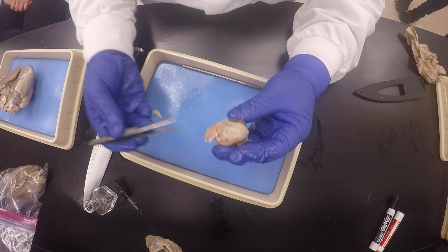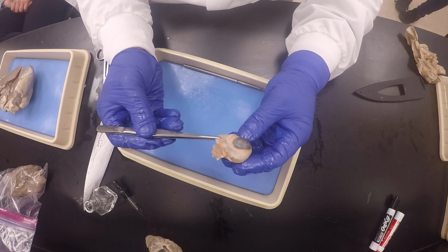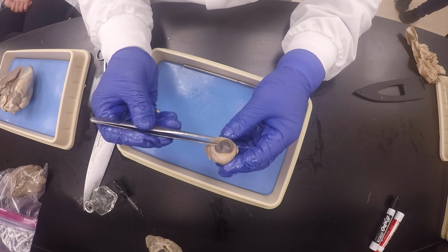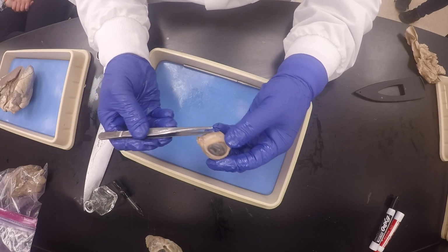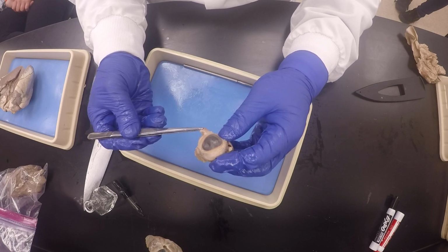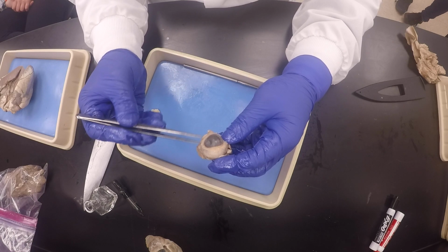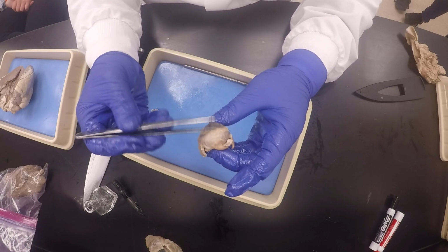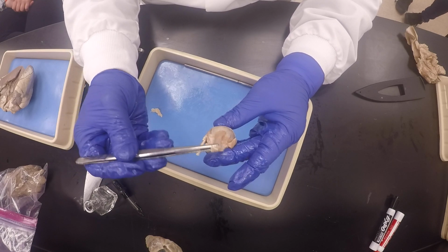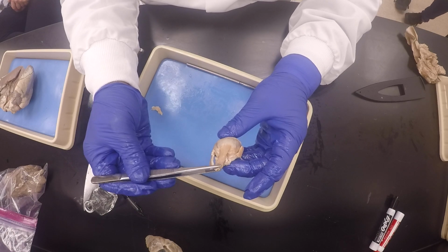The camera is on. So this is the lateral rectus, and this here is the inferior oblique. Looky, it's pointing to this long side, and so here you would see only one. Unfortunately, it got cut a little bit, but it's still there. So that's the inferior rectus right here. Okay, if this is the inferior side, then this side has to be the superior side, and you're going to confirm it. Why? Because then you would have one at the compass point, which is the superior rectus.